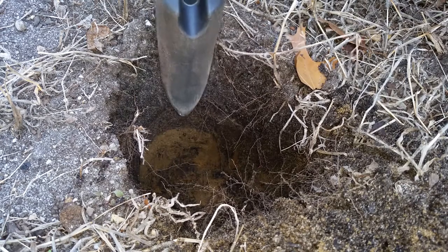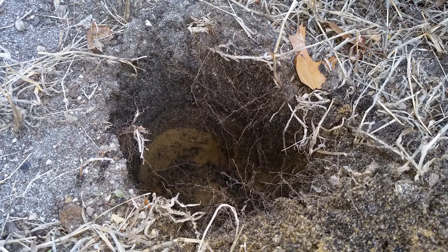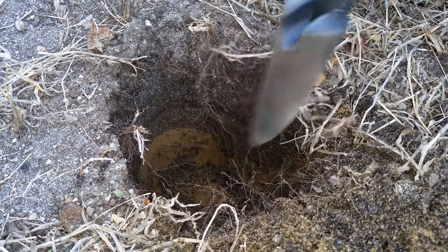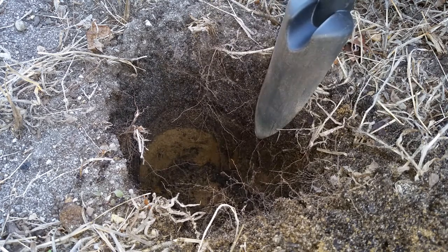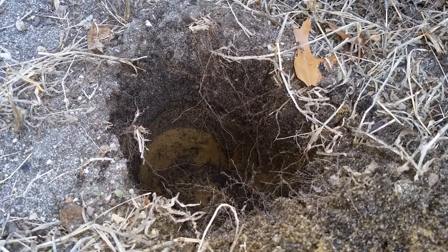As far as taking our soil sample — if you've never taken one before — this is a long bed approximately three feet wide and about 15 to 18 feet long. So I'm going to take three samples: one a couple feet away from one end in the middle, one a couple feet from the other end, and one straight in the middle of the bed. That should give us a decent average of what we're looking at.